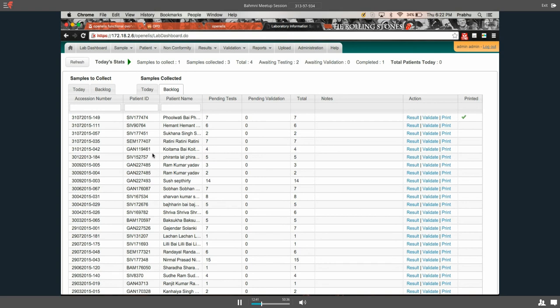Okay. So right now, at least the way people handle this is by the sample number. The way it's set up here is the date followed by the number on which it was collected. So what I've seen people do is order it by the sample accession number and see which ones are really taking long.